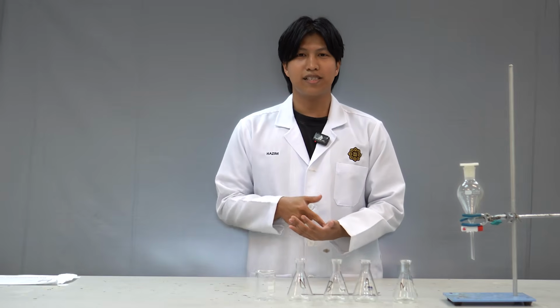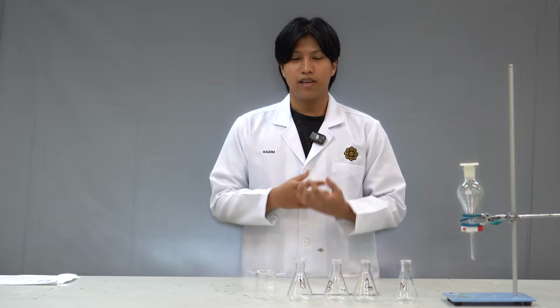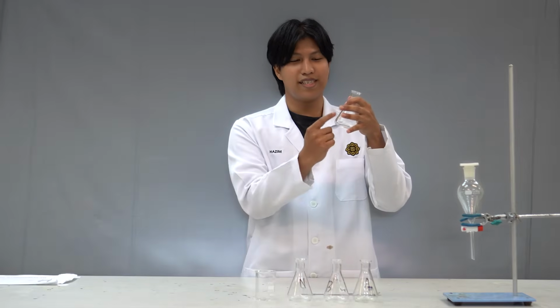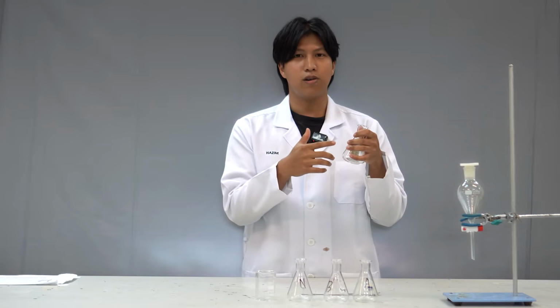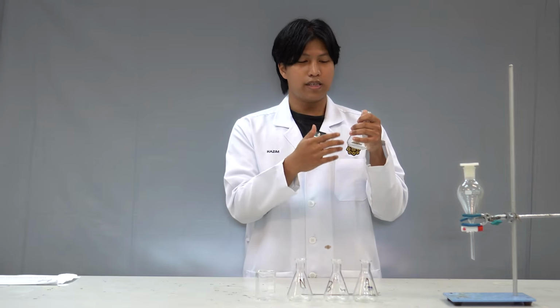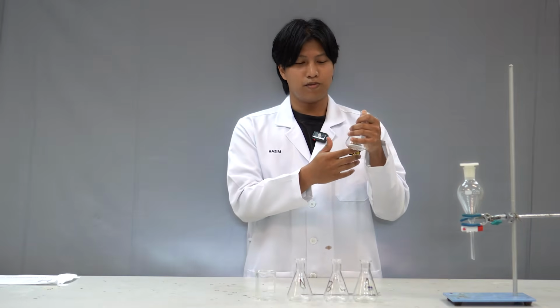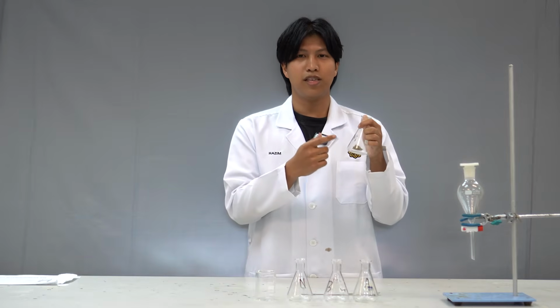So the necessity of liquid extraction is separation and purification. For example, this is a flask that contains a mixture of acid, basic, or neutral compounds. So we want to separate this kind of mixture into, for example, acid, basic, or neutral, by using the solvent, which is DCM.